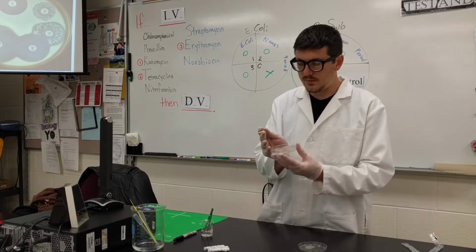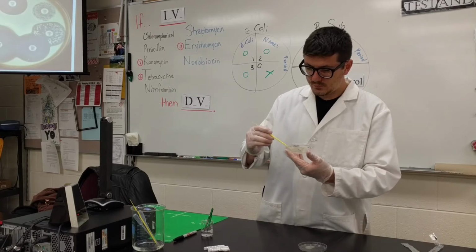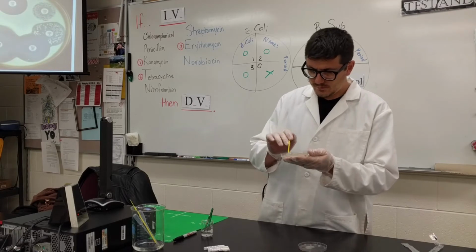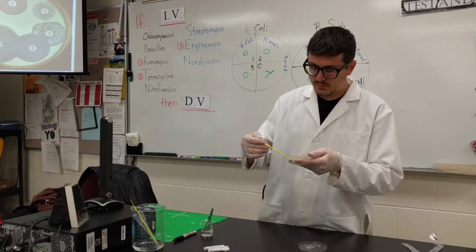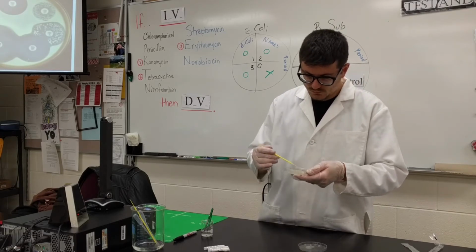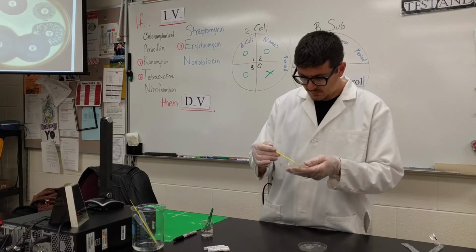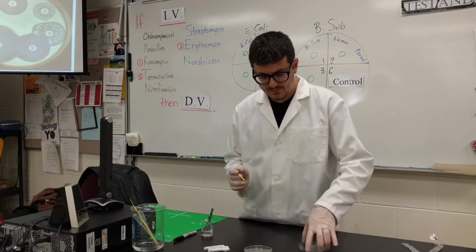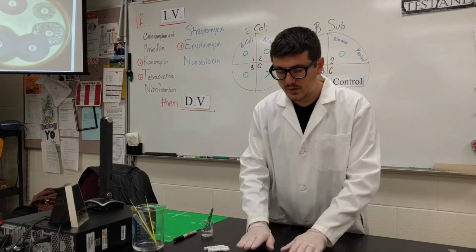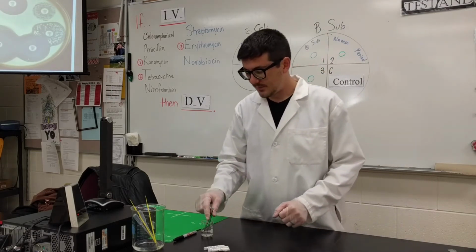Nice and gently moving it around. All right, now I'm gonna let it sit for a few minutes, and then I'm gonna put my kanamycin on the first one. So we'll pause.